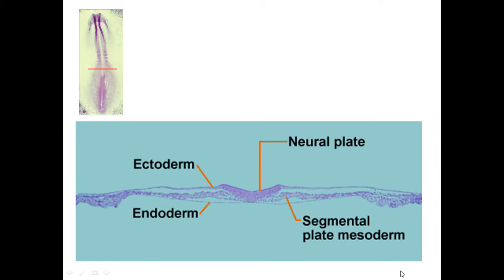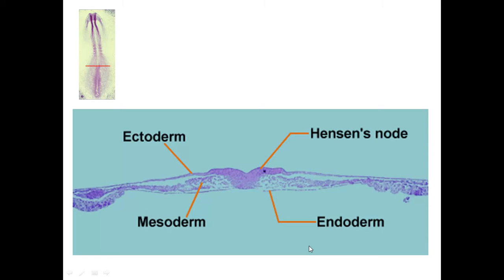Okay, but you can also see it here. It's more evident. The neural plate is still flat on this region. The neural folds are just about to rise and eventually meet.